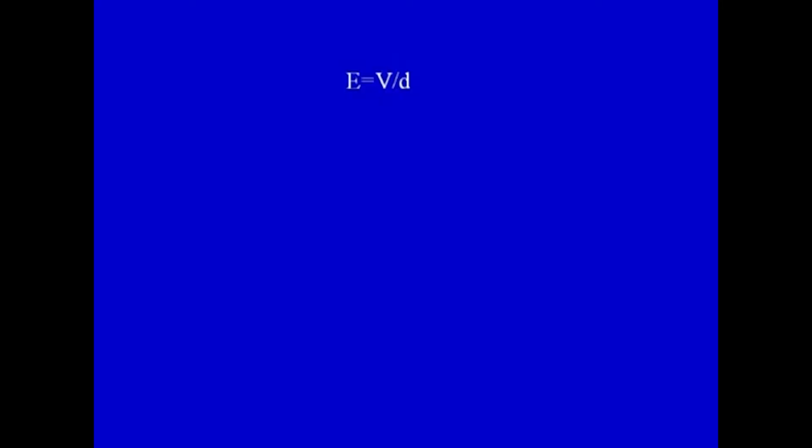All right. So, let us get into a little bit of the basic principle of electrophoresis, for which I have given a little overview. When a potential difference is applied across the electrodes, it generates a potential gradient, given by E, which is the applied voltage divided by the distance between the electrodes, that is, E equals V upon D.